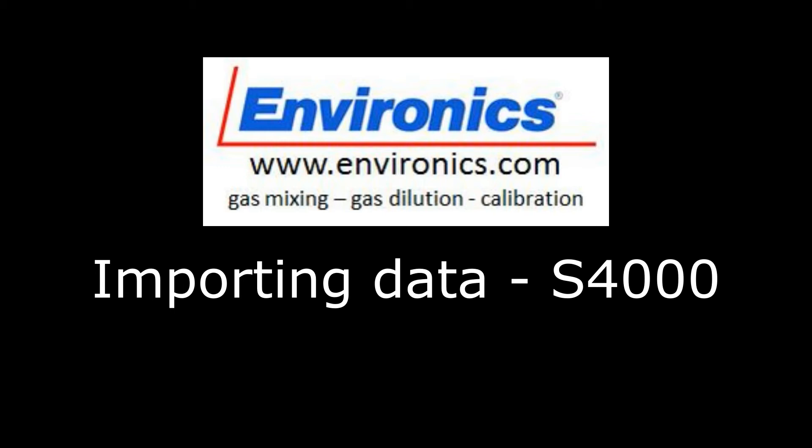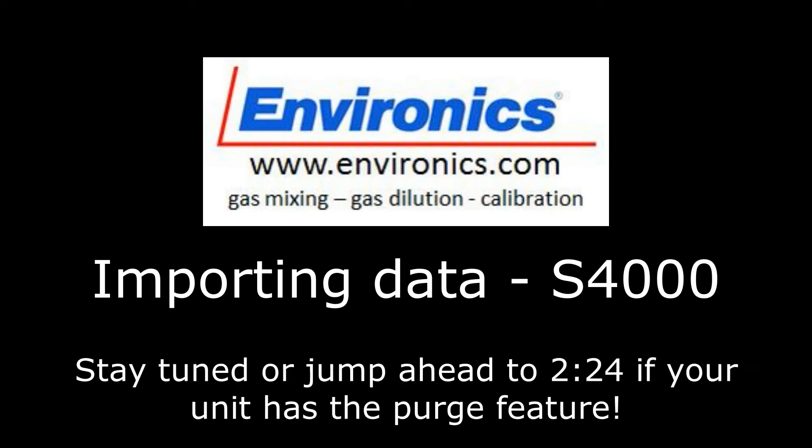Today we're going to look at how to import your instrument data into your Environics Windows 7, 8, 10 software. Whether that be a 4000, a 4040, or a 4020, the process will be the same.